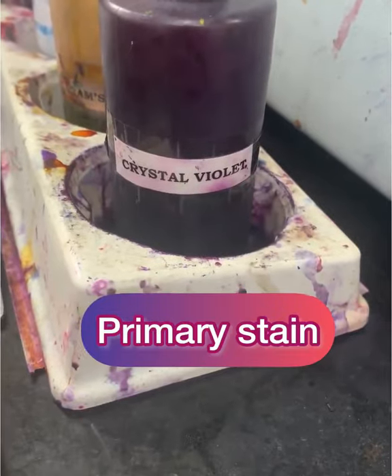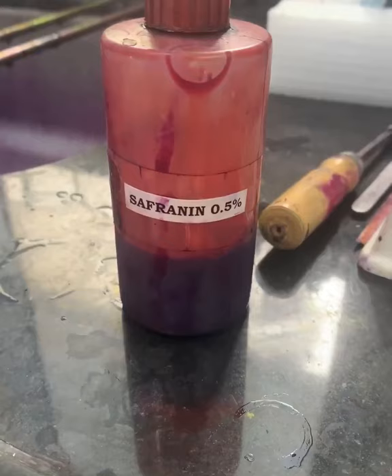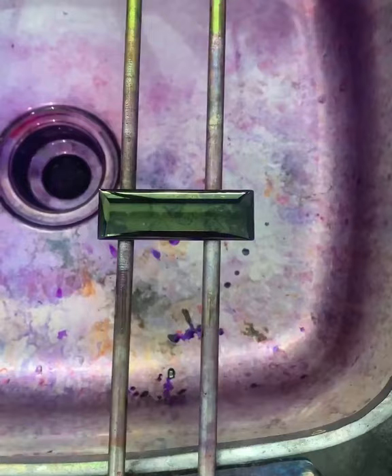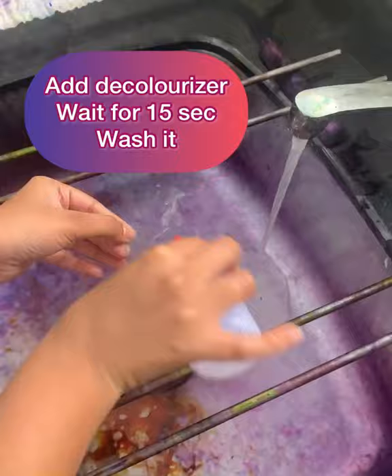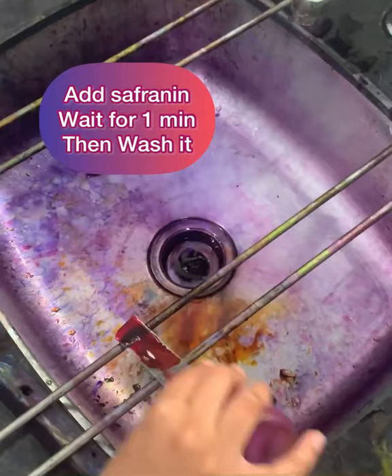Primary stain crystal violet, the iodine, decolorizer, counterstain safranin — a timer on this slide. We have kept crystal violet, which will be washed, and then put the iodine, keep it for a minute, again wash it under water, and then put the decolorizer, keep it for few seconds, and then wash it under water, and then we put the counterstain safranin and keep it for a minute, and then wash it gently under the tap water. After this, we dry the slide and keep it for air drying.